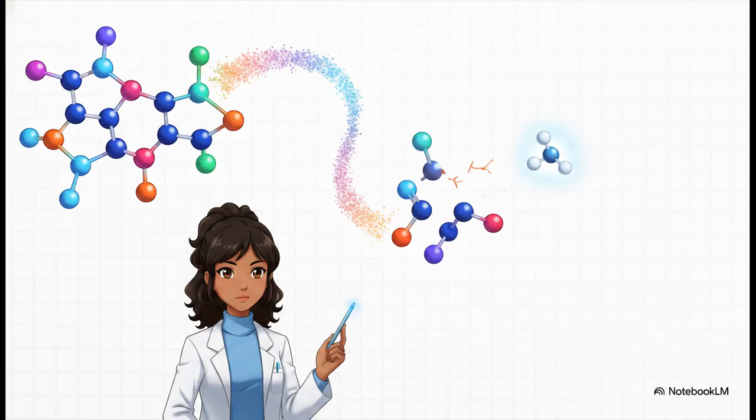Once you've got the full mass figured out, step 3 requires you to look at the gaps between the peaks. You're looking for the loss of small neutral molecules. For instance, if your molecular ion is at 100 and your next major peak is at 82, you lost 18 mass units. What weighs 18? Water, H2O. By identifying these diagnostic loss pieces, like water, ethylene, or carbon dioxide, you can logically deduce what functional groups must have been attached to the original molecule. At this point, it's really just simple subtraction.